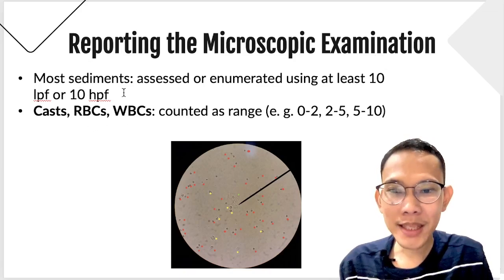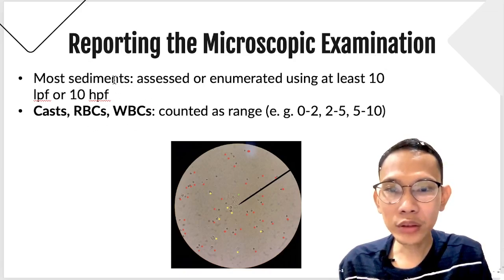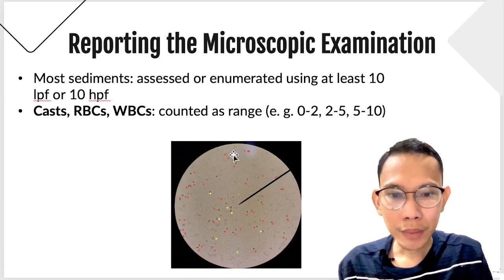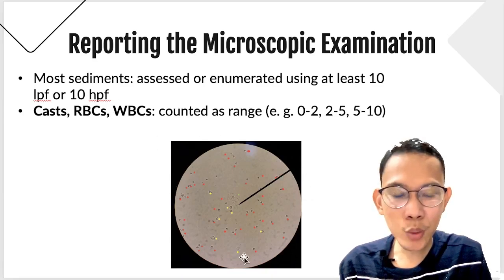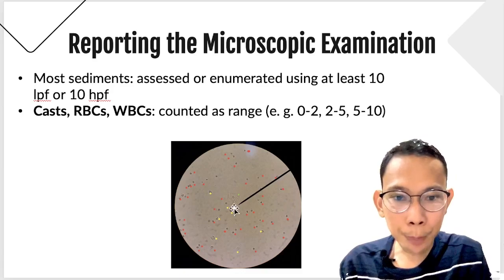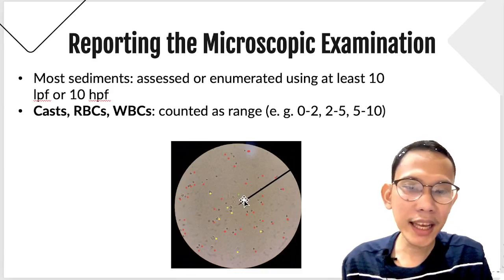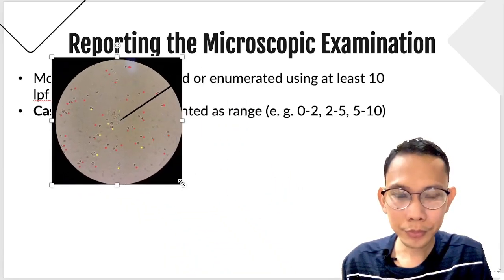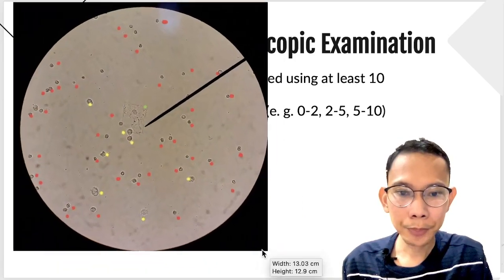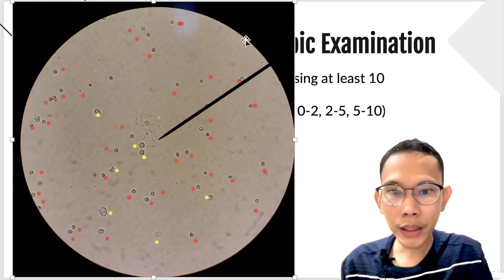Again, your red blood cells and WBC are counted in 10 high power fields. Okay, for example, this is one field, right? This is one field. And then you move your microscope on the other side. That's another field. So, from tip to tip talaga yan, guys. Kasi ang nangyayari, paminsan-minsan, lakihan ko ha. Ayan. Lakihan ko pa para makita niyo. Ayan. This is one field, right?